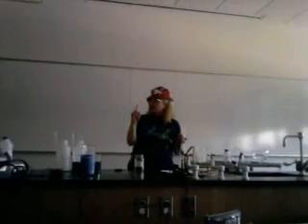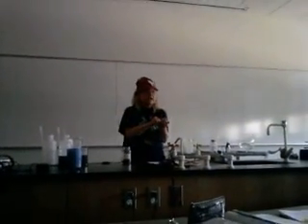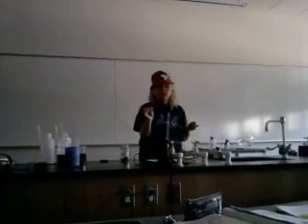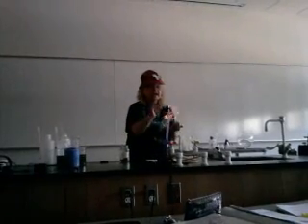Okay, we know that actually what is occurring is the iron is reacting with the oxygen in the air. Yes or no? But we're going to speed up the reaction because we're going to increase the temperature.